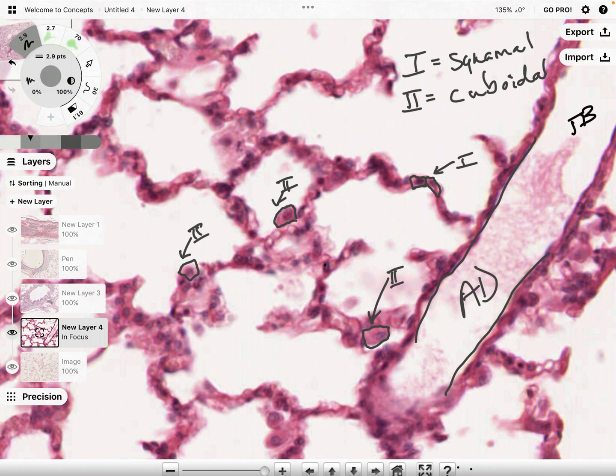The last thing to talk about would be a roaming macrophage, and I do believe we actually have a pretty nice one here. Definitely have a stained nucleus, albeit it's not typically large like you expect with macrophages, but it is a very large mass. It could just be the way this was preserved and laid down on the slide, but it looks like a very large plasma membrane with a nucleus in the middle there. So I'm going to call that a roaming macrophage. So roaming macrophages are obviously very large cells. Their whole purpose is phagocytosis, so they're going to be very large so that they can actually phagocytize things. All right, so I'm just going to denote that with RM.